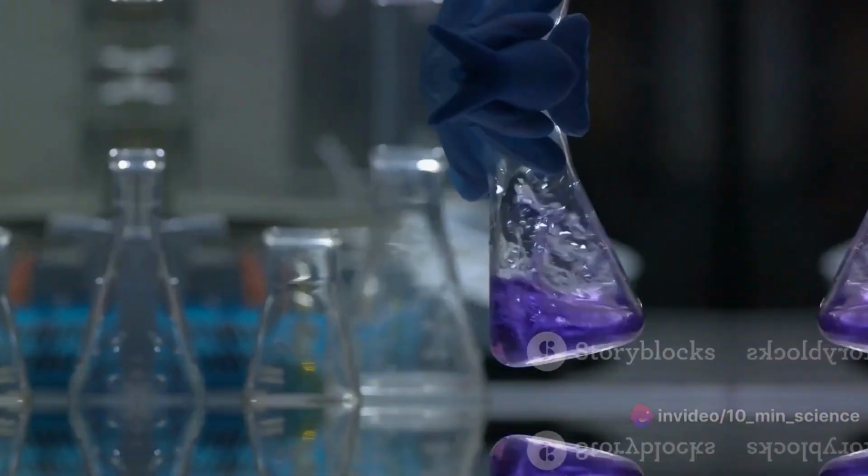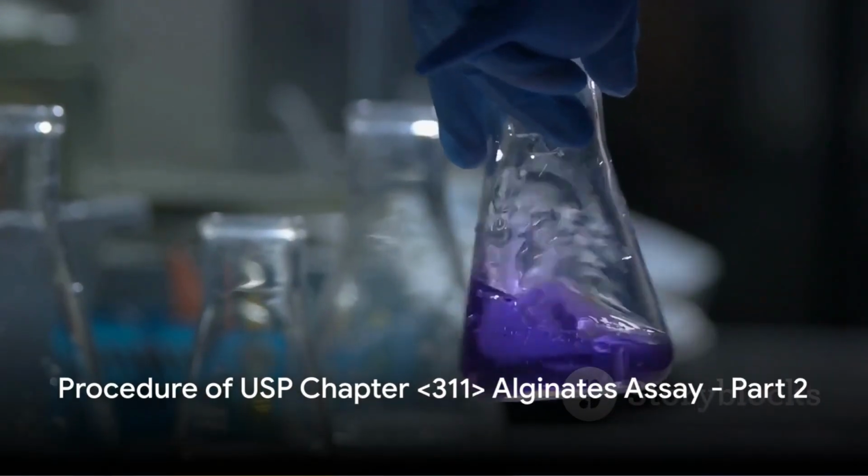And there you have it. We've weighed and dissolved our alginate sample, prepared our reagents, set up our titration apparatus, and prepared a blank solution. With everything set, we're ready to move on to the actual assay procedure. We now move on to the heart of the assay procedure.